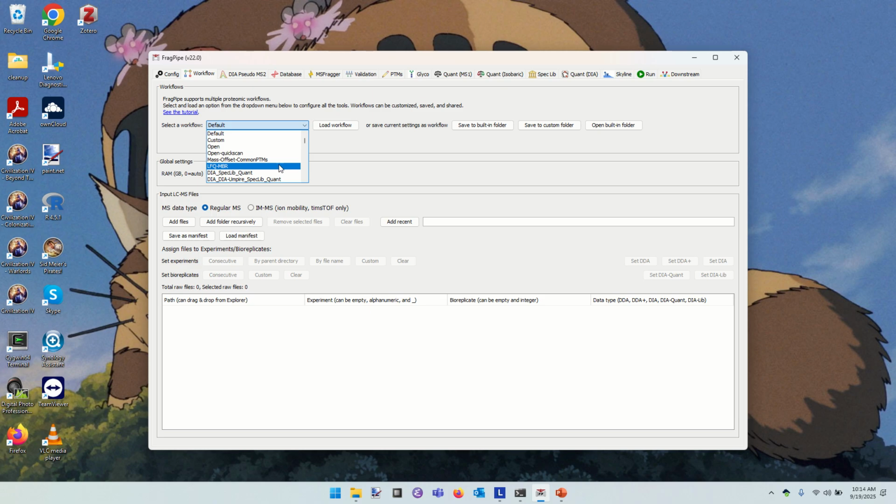But in general, we find that label-free quantitation is the most common way that people do quantitative proteomics now, which means integrating the peptide signal without any isotopic labeling at work. And that's the LFQ part. The other is MBR, or match between runs.